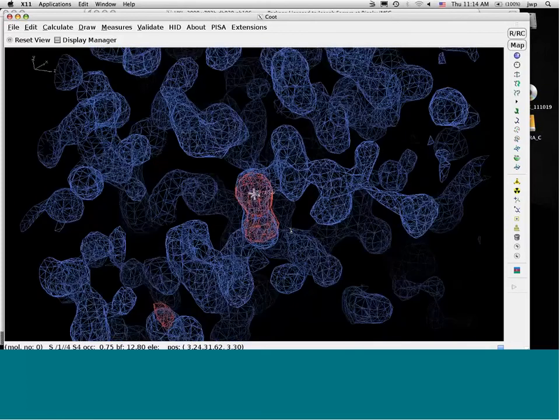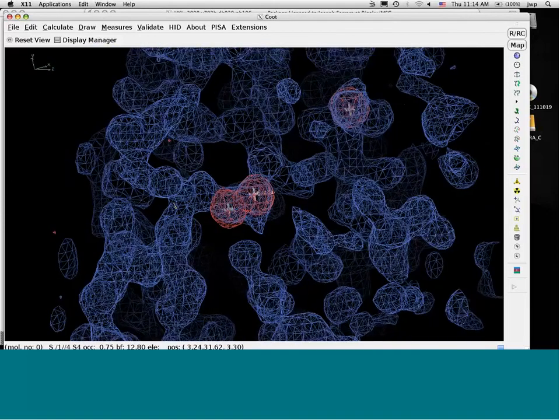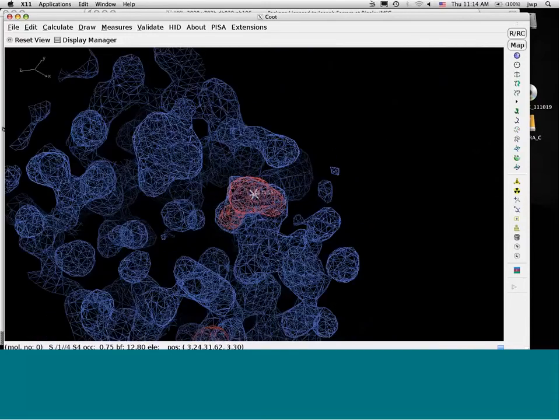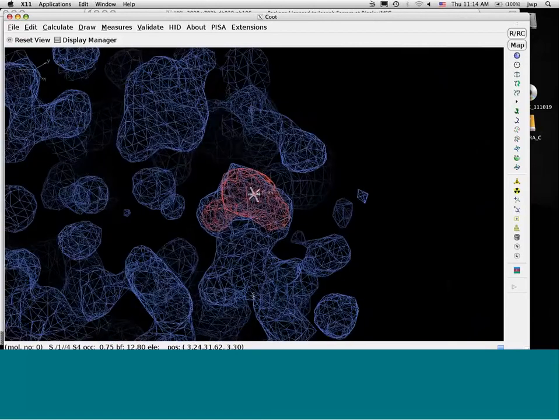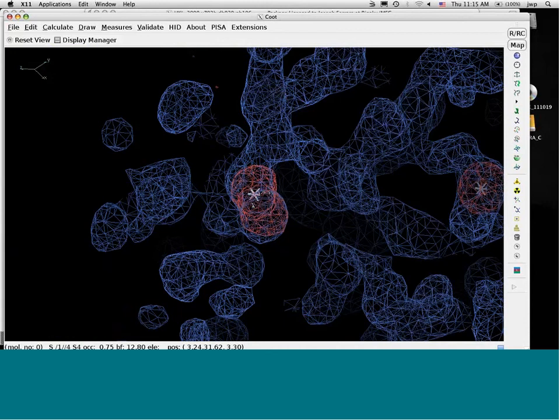And what you see here, here's a peanut shape. SHELXD did not find this other sulfur. It just found the one sulfur there. Here, for this disulfide, it found both sulfurs. Here's a case of a methionine that's disordered, actually. I happen to know from looking at the refined maps that the side chain goes up this way and also goes up this way. It looks like it's at least 60% occupied on this side and some on this side. But SHELXD just put one atom right here, and it's probably not in the right place.